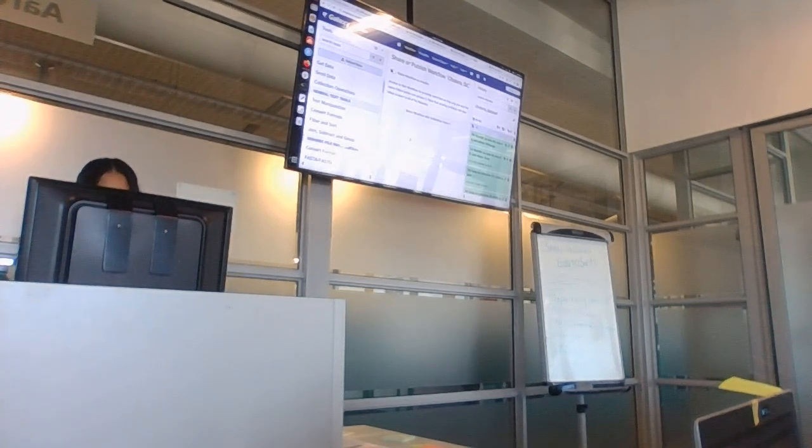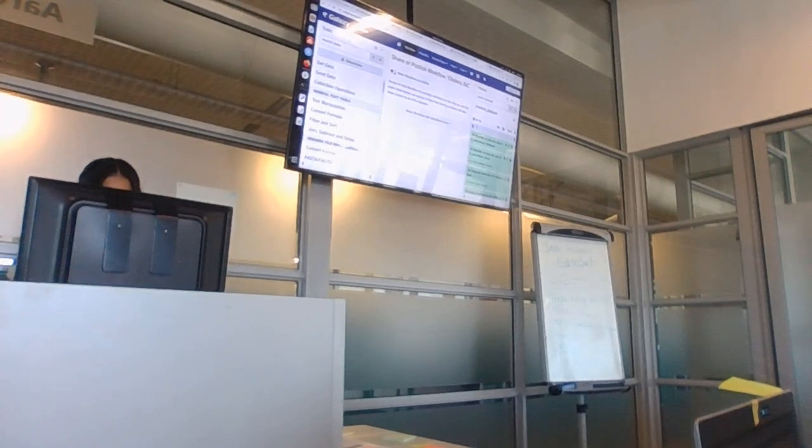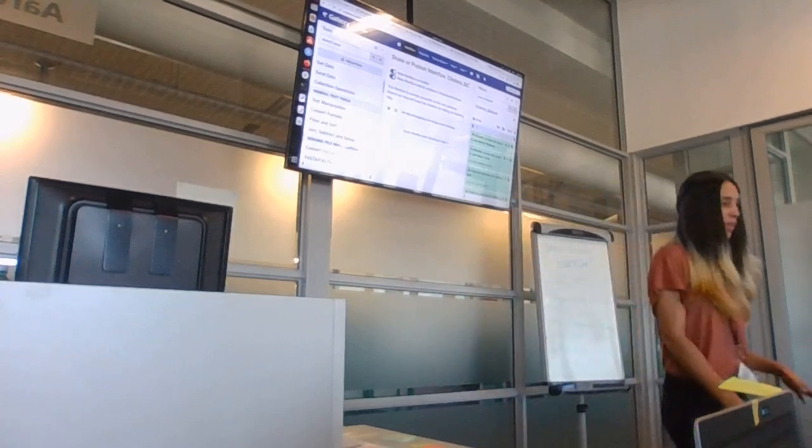And of course, just like with the history, you can share the workflow with someone by clicking on share. And if you are very brave, you could make it publicly available so that anybody can run your workflow.